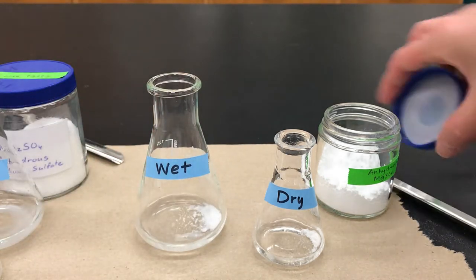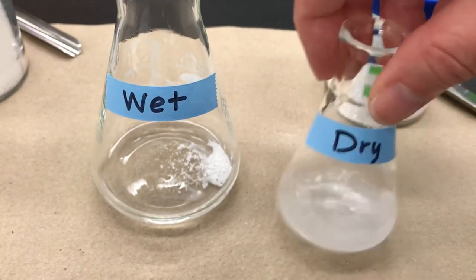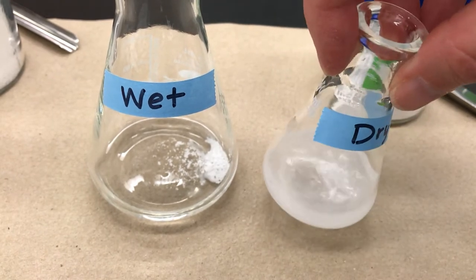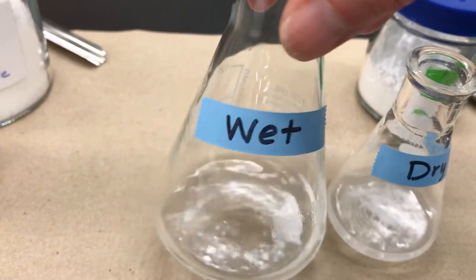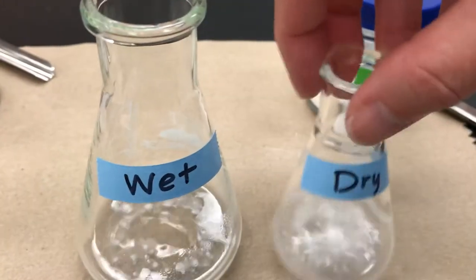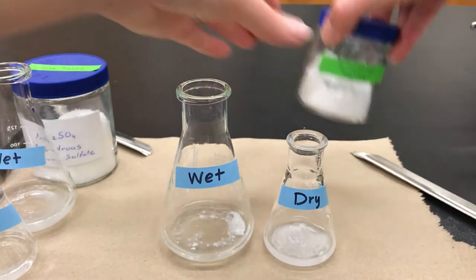Give it a swirl. Because of the very fine particle size of magnesium sulfate, when you swirl it and there isn't any water, it's going to float in the mixture and create a cloudy appearance. When it's wet, it's going to clump similarly to the sodium sulfate and won't create as much of a cloudy appearance. You're basically looking for small particles that aren't clumping.